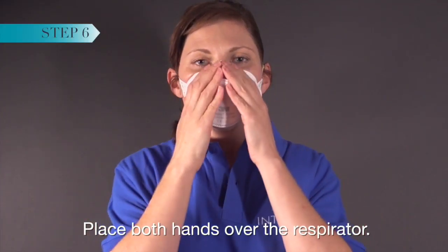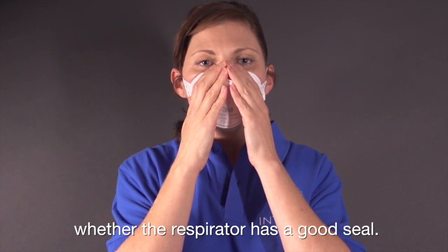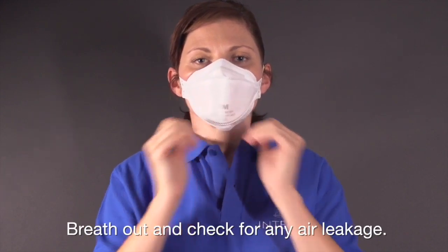Place both hands over the respirator. Take a quick breath in to check whether the respirator has a good seal. Breathe out and check for any air leakage.